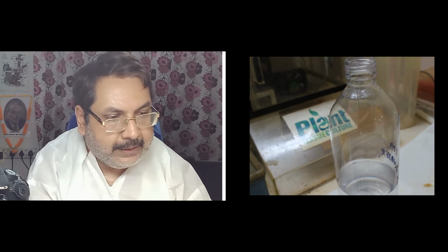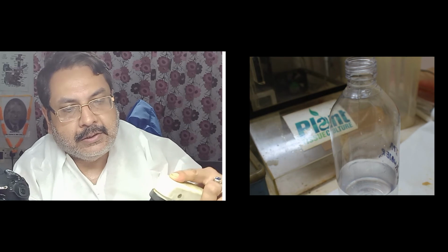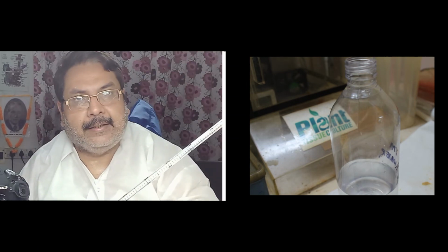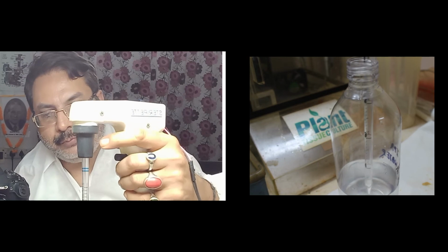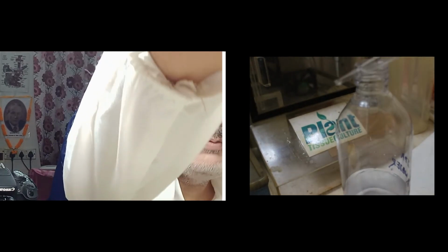So when you insert a pipette like this, this is a 5 ml pipette. If you insert this 5 ml pipette over here, this is also an auto pipette like that, and it does not release air. So it is not required. You just put it inside, and you have to switch on the power. Before that, the power is off.